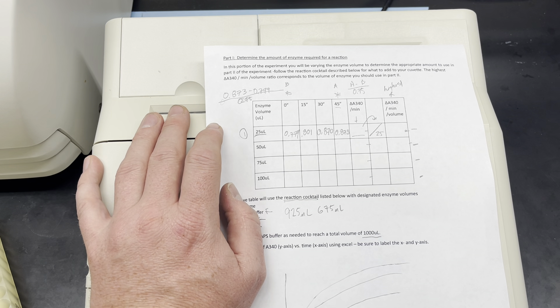You need to do four trials with these different enzyme volumes and determine what is the sweet spot — what is the highest ratio among the four different conditions. You can ultimately say what's the right amount of enzyme to use for all of your trials. I hope this is helpful. This is part one of your experiment. Let's look at the next step.